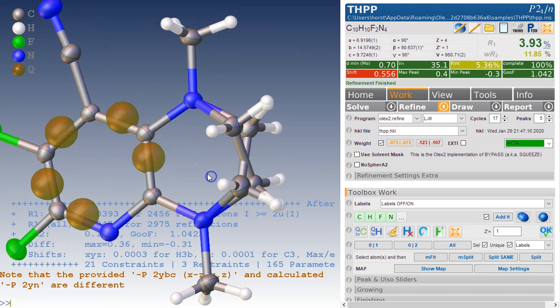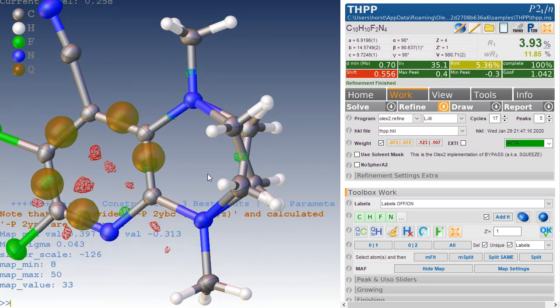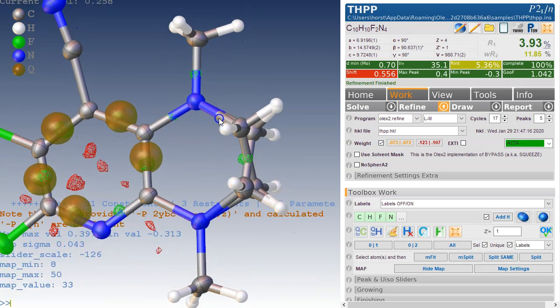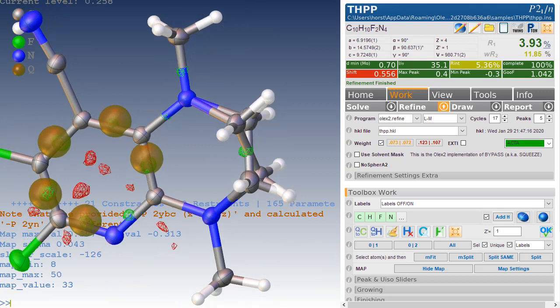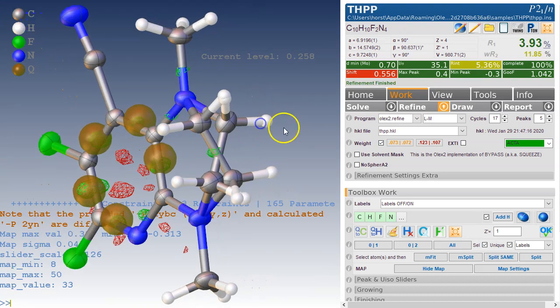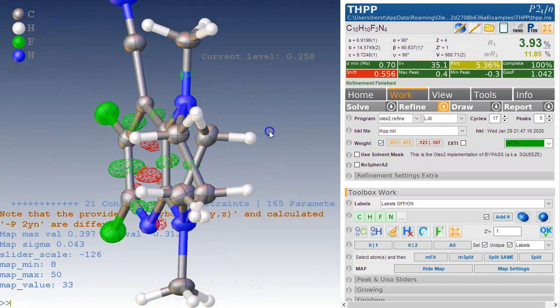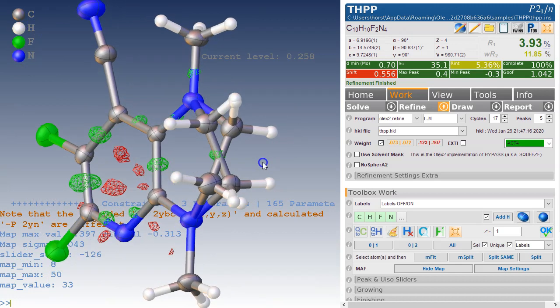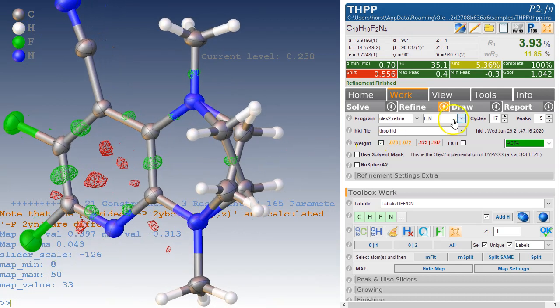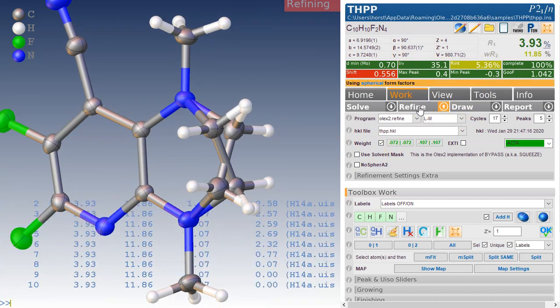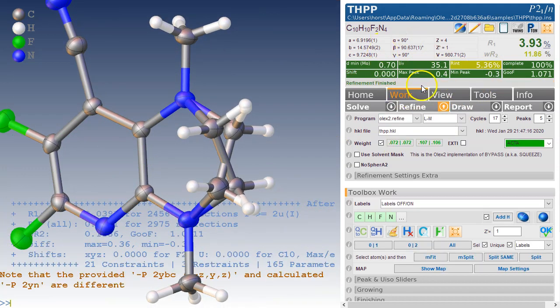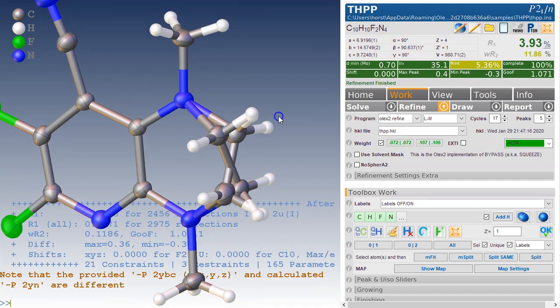Now these peaks are now all on the bonds and Ctrl M, looking at the map, there's also really very few residuals now. At the current level I can move, there's a shift in the left mouse, 0.258. So there's very little residual. So this is actually a valid model and it's still not settled. So let's refine this a few more times and see whether it settles, and it settles completely.